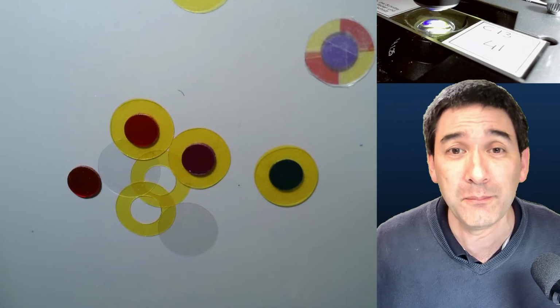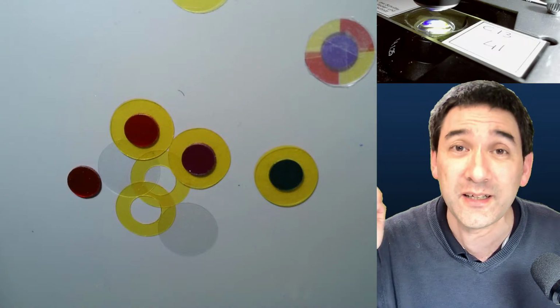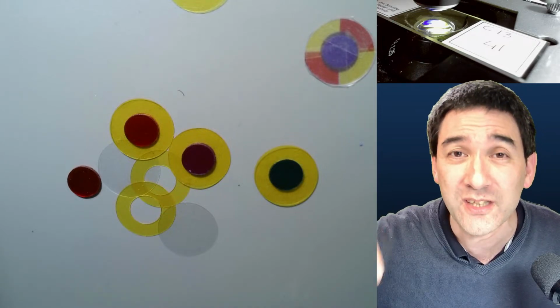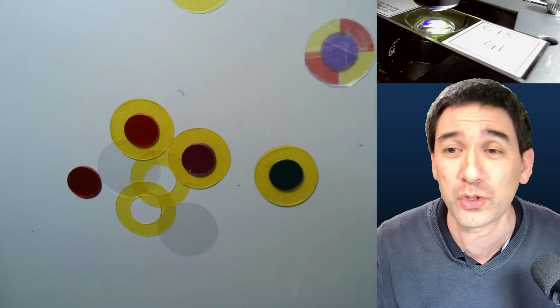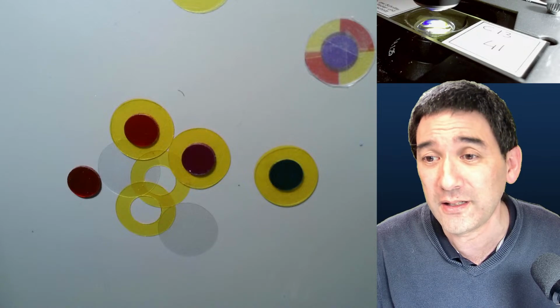And for example, the microscope, not this one that I'm using right now, but the other one that I have, is designed in such a way that there are not even any optics between the camera and the objective. The objectives project the image directly onto the camera sensor, to make sure that there's absolutely no loss of image quality. Right. So this is a little bit of an issue. Yeah, I get it.